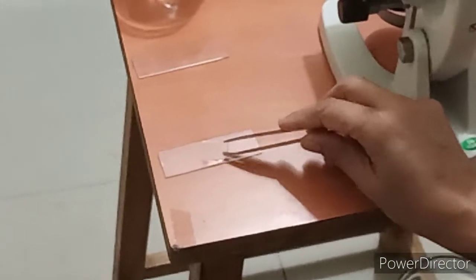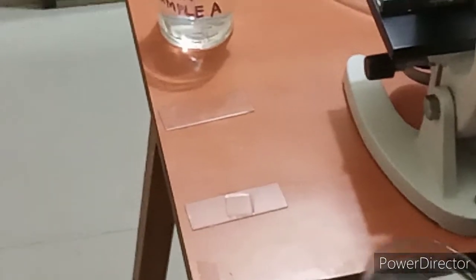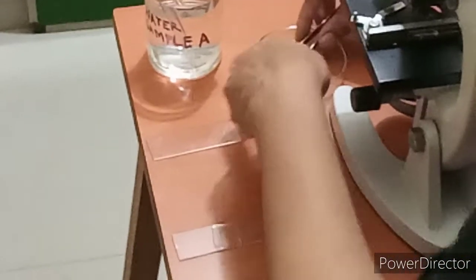As we know that tap water does not contain any microorganisms, but still let us observe it under the microscope.